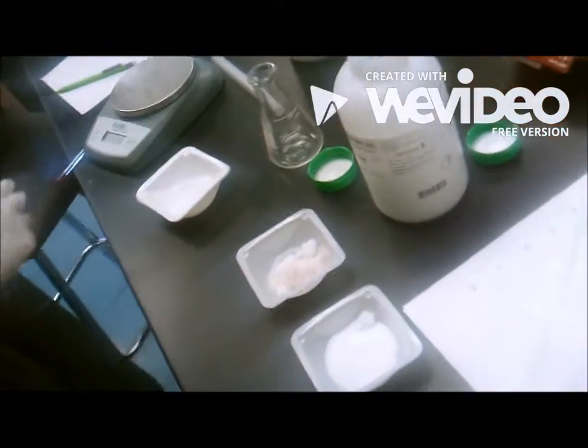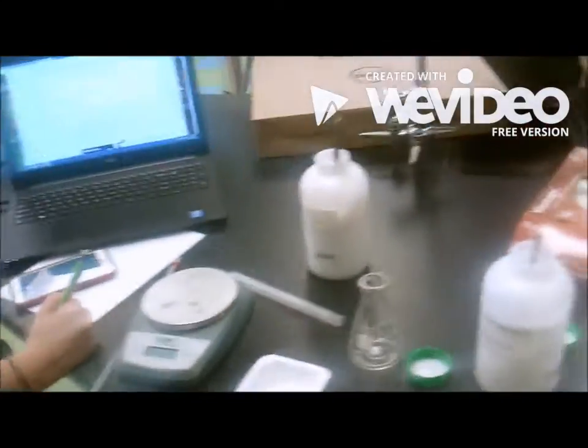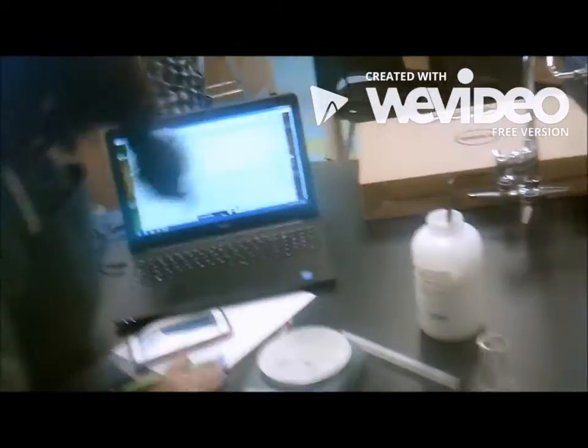Using the protective gloves or a stopper, pick up the flask, and you will observe that the flask is frozen to the wooden block and both will be lifted.